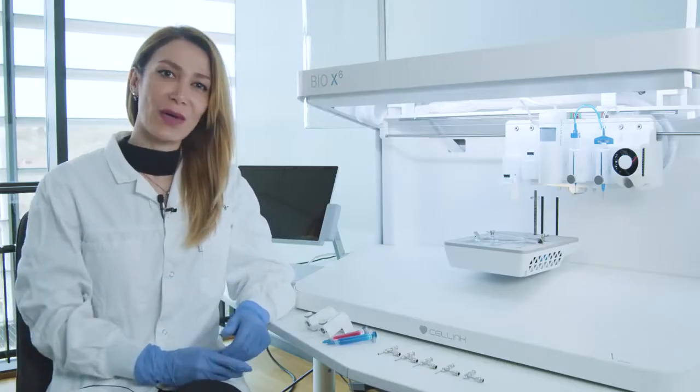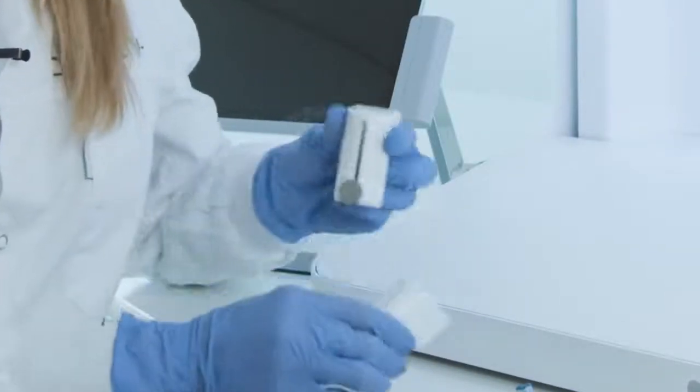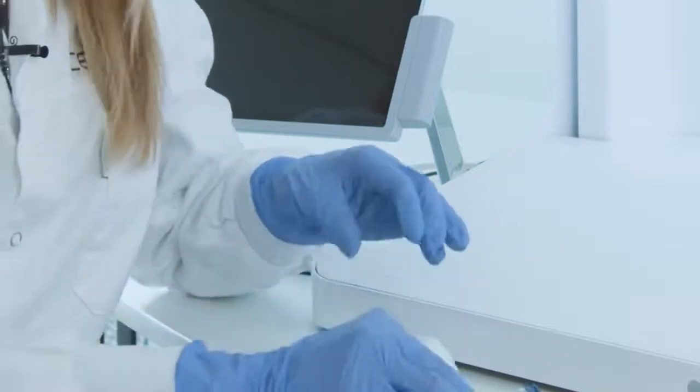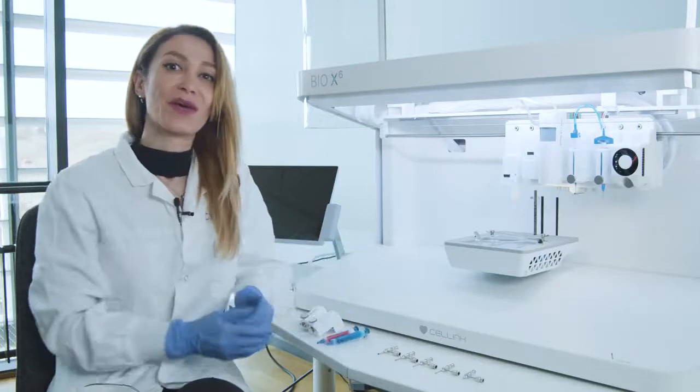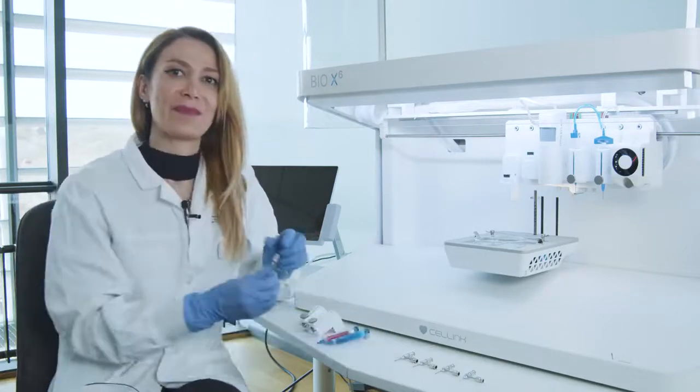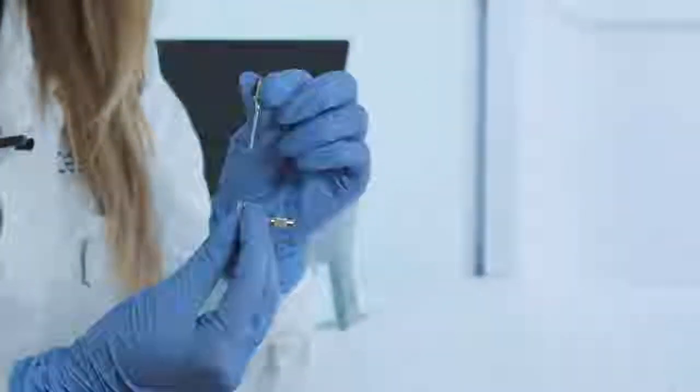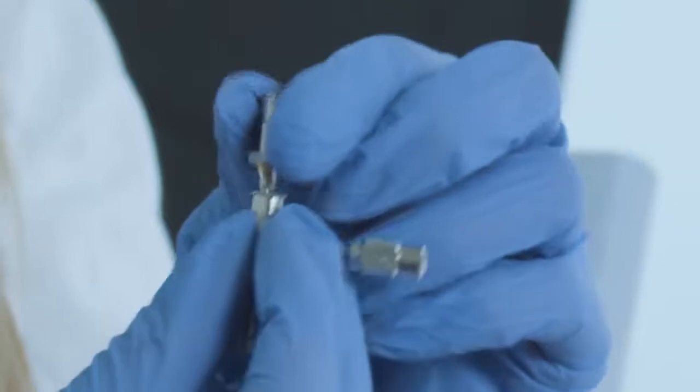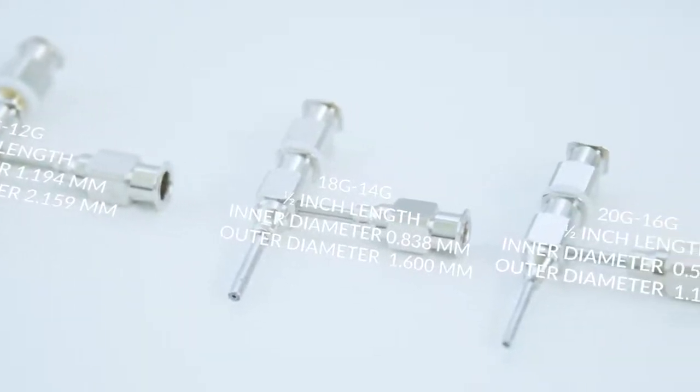The requirements for coaxial bioprinting are two pneumatic print heads, bioinks for inner and outer layers, and of course coaxial nozzles which are available in different gauge sizes and lengths. It's including a nozzle specific for the inner layer which is located into the other nozzle designed for the outer layer. And the gauge size for each is written on the nozzle.